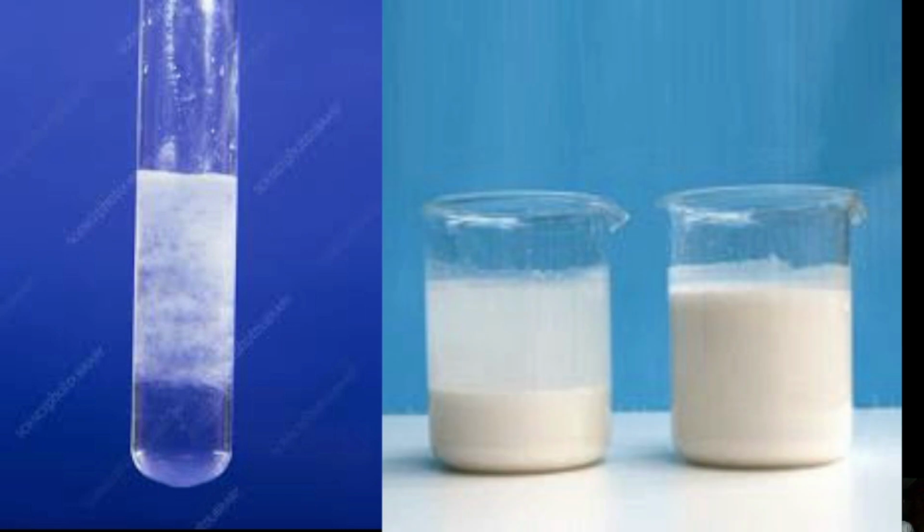Okay, so having said that, this on the right side is the chalky, this on the left side is the gelatinous. I just wanted to emphasize that to help us understand this better. Moving ahead, that is what we refer to as the white gelatinous precipitate. So we continue our journey.